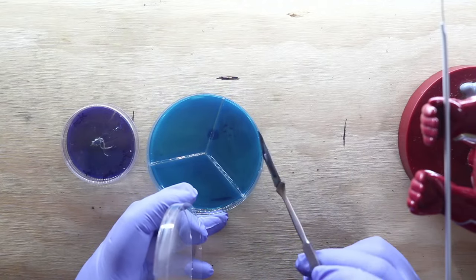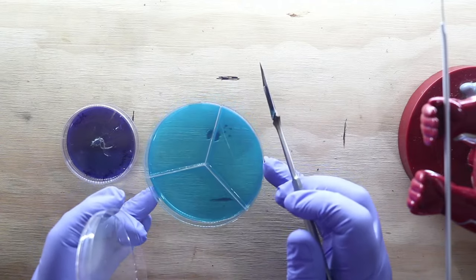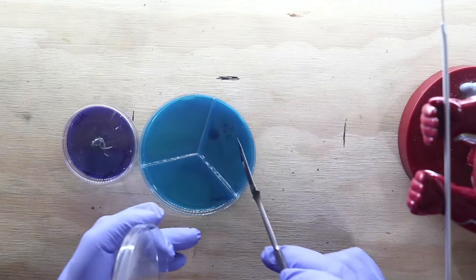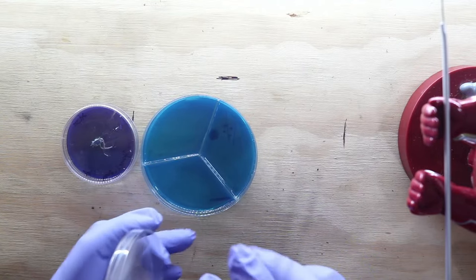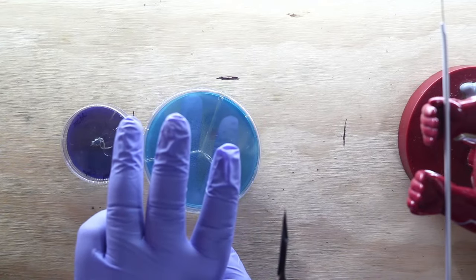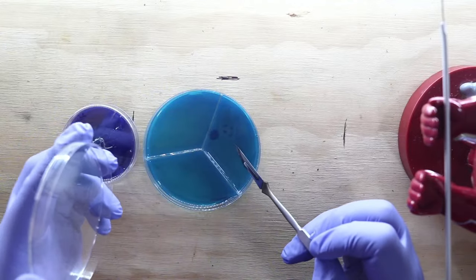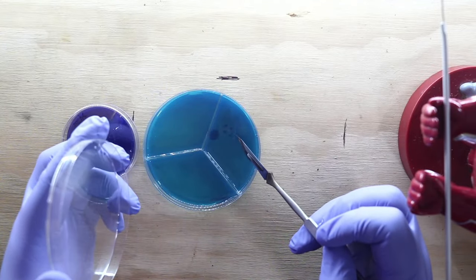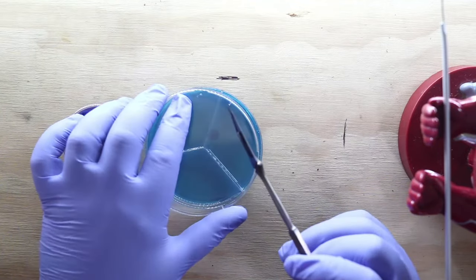And Samantha, can you see that bird of prey? Barely. I don't know if you guys can see that or not, but I've cut three places. Main line, right line, left line, and it makes kind of the front of like a bird of prey or chicken foot or whatever you want to call it. And I do this because when we place the transfer right down here, mycelium can grow and leap over these cuts much easier than bacteria can.